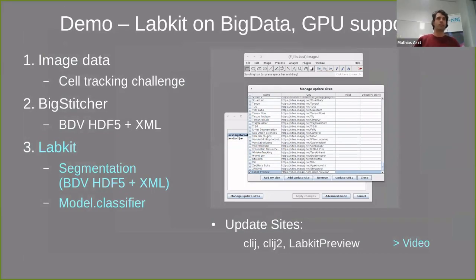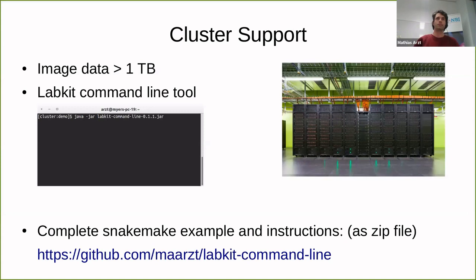That was the demonstration of LabKit on big images. We quickly got a preview; segmenting the full image takes about eight minutes for this four-gigabyte image. If your image data is even bigger, you might consider using an HPC cluster to calculate your segmentation — and LabKit also supports this.